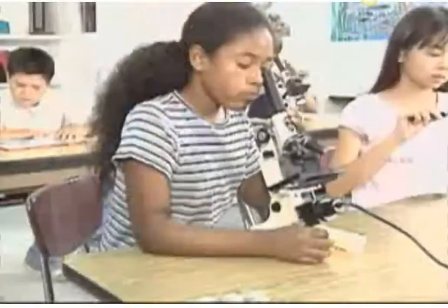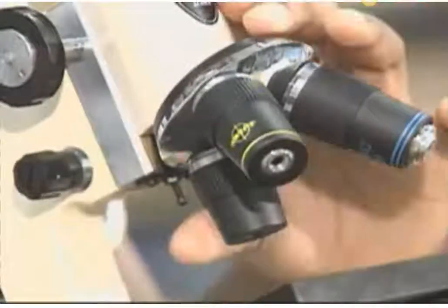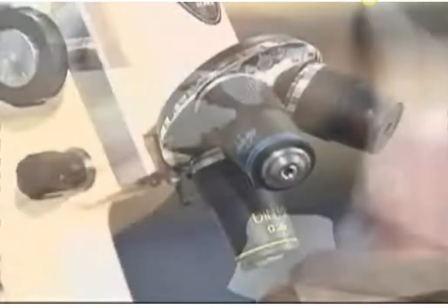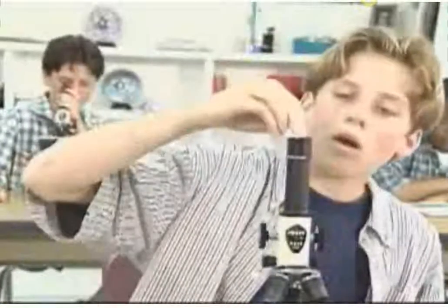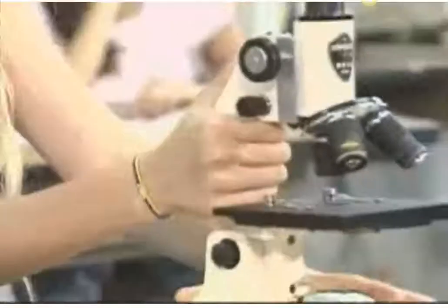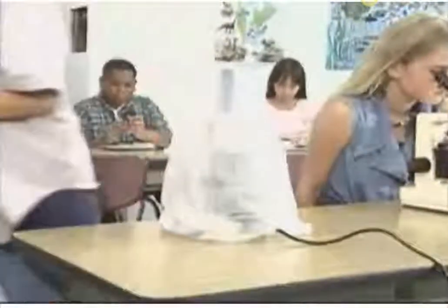The microscope is a delicate instrument and should be handled with great care. You should never touch the glass in the lenses. Finger marks can damage a lens. Lenses should only be cleaned if they're dirty, using lens cleaner and lens tissue, rubbing with a gentle circular motion. A microscope should only be carried by its arm and base, and when not being used, a microscope should be replaced in its storage case or protected with a dust cover.